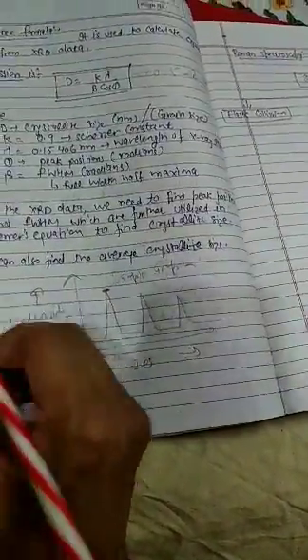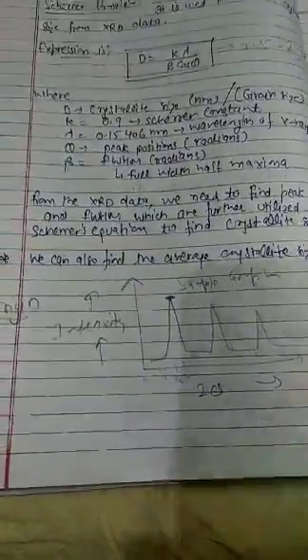This is the full width and then half maximum, FWHM. Basically we have a software called Origin that we most of the time use to calculate FWHM as well as the peak positions.